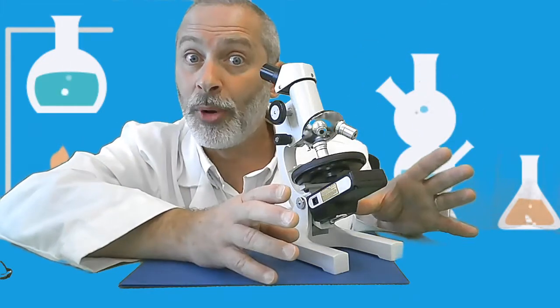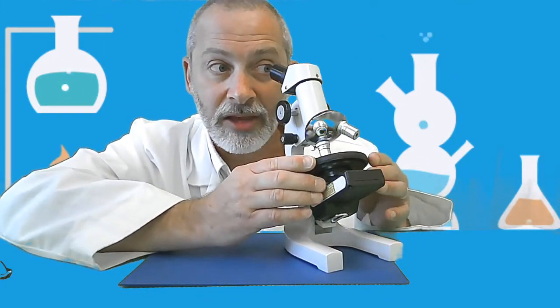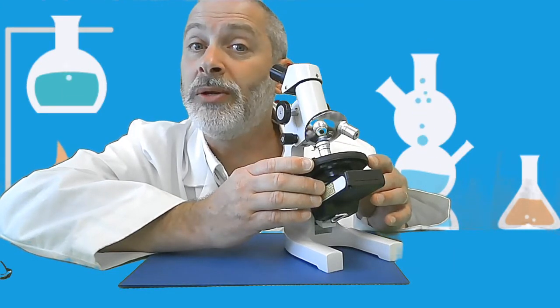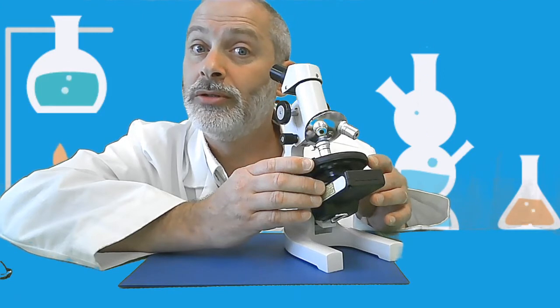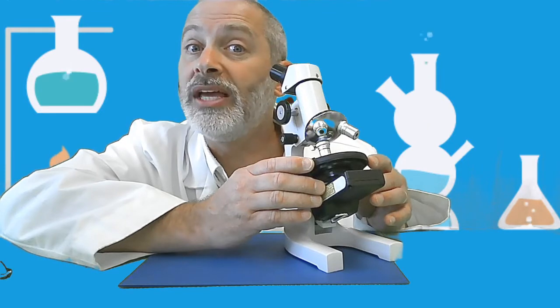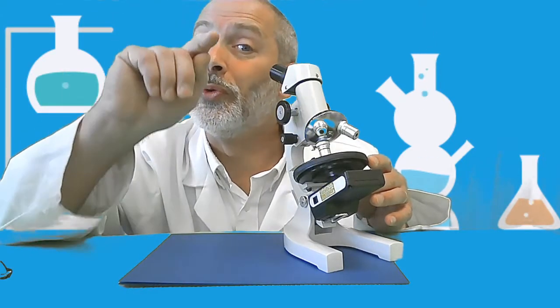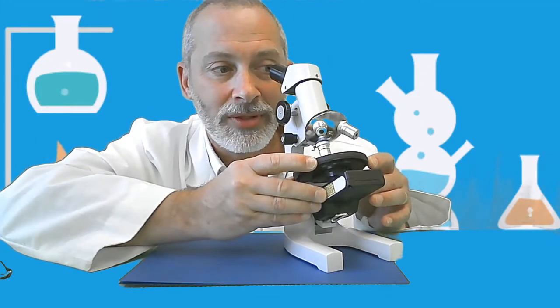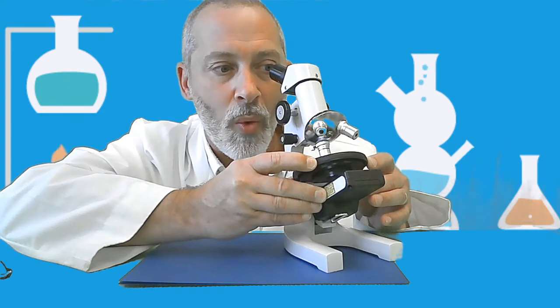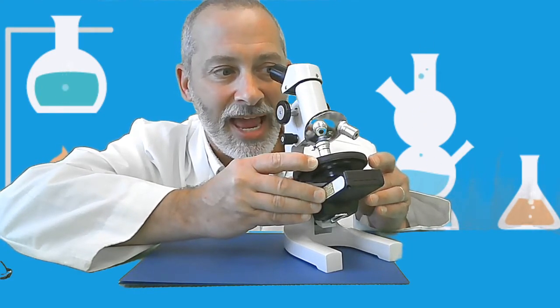So while both eyes are open and while you're looking in, if you want to hunt the image to the left, which way should we move the stage? If we want to look to the left of the image, which way should we move the stage? To the right. That's right. So that's exactly what I'm going to do. Oh, wowee kazowie. If you want to go up, move it down.